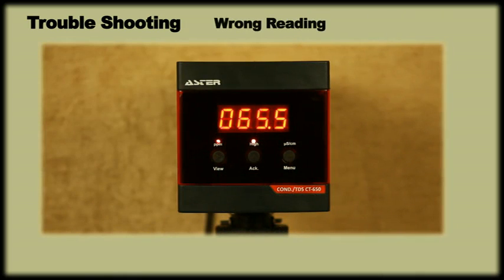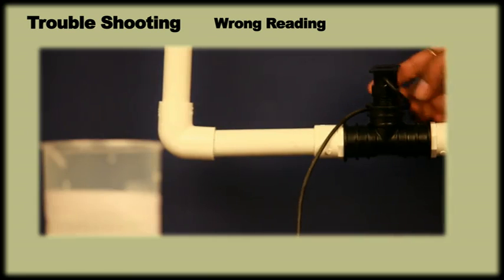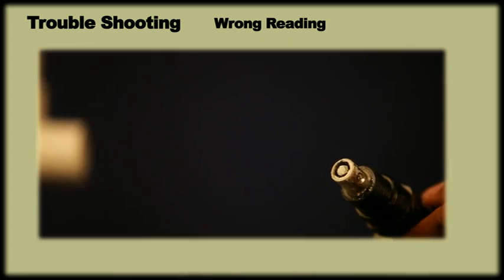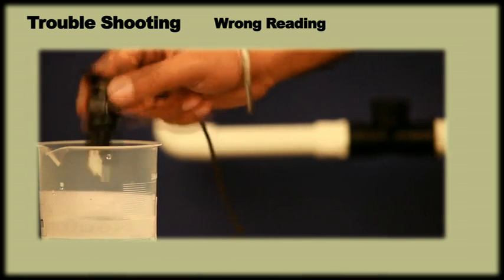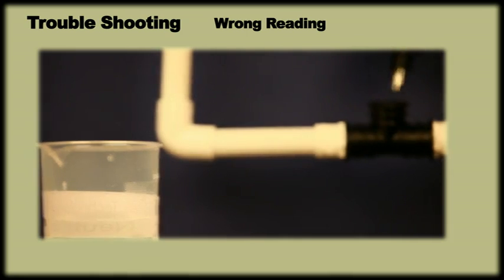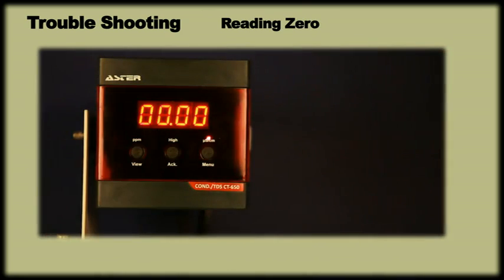If the meter shows wrong reading, it could be because of the following reasons. Check whether the sensor is installed correctly as per installation guidelines. If the sensor still shows wrong reading, then remove the sensor from line and check for any scaling or fouling. Clean the sensor in mild acid and reinstall. If it still shows wrong reading, then contact the nearest service center.